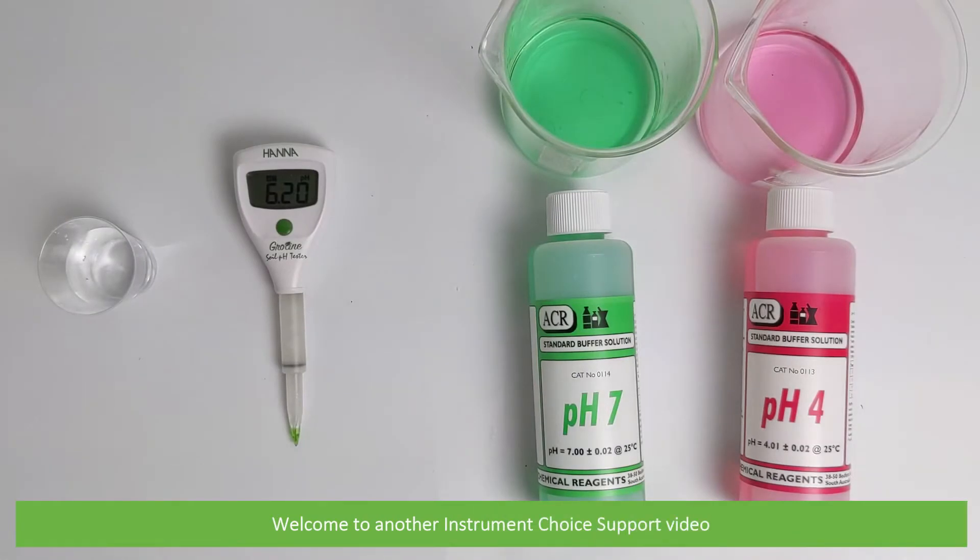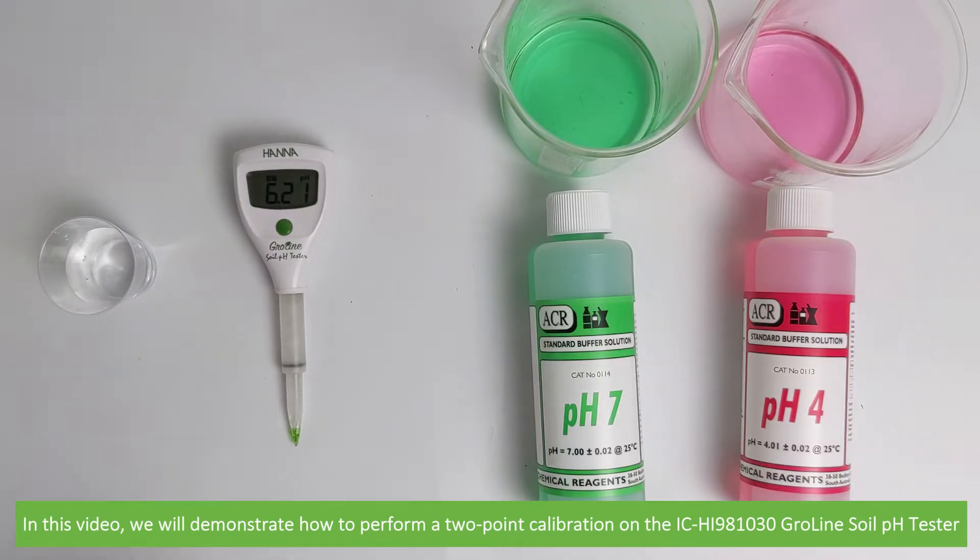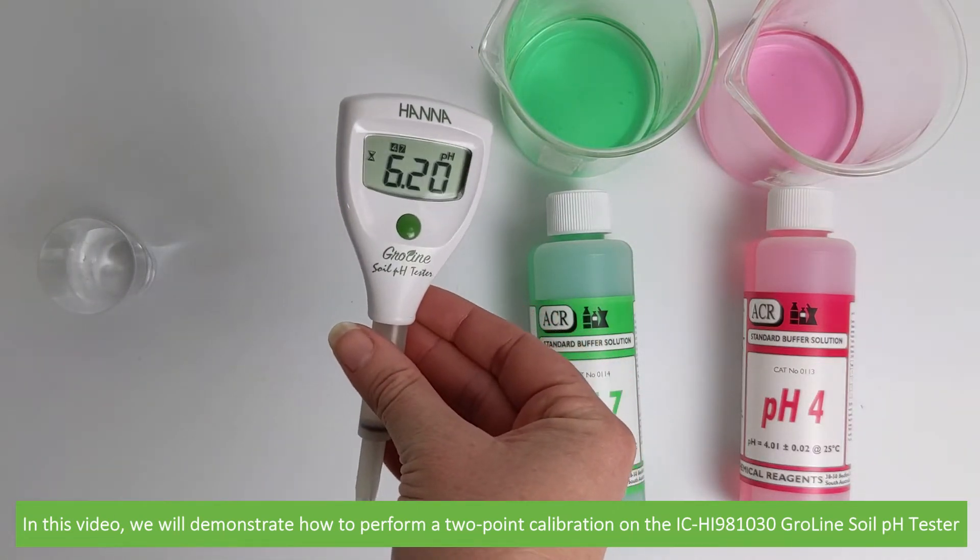Hi and welcome to another Instrument Choice support video. In this video we'll demonstrate how to perform a two-point calibration on the IC HI981030 Growline soil pH tester.